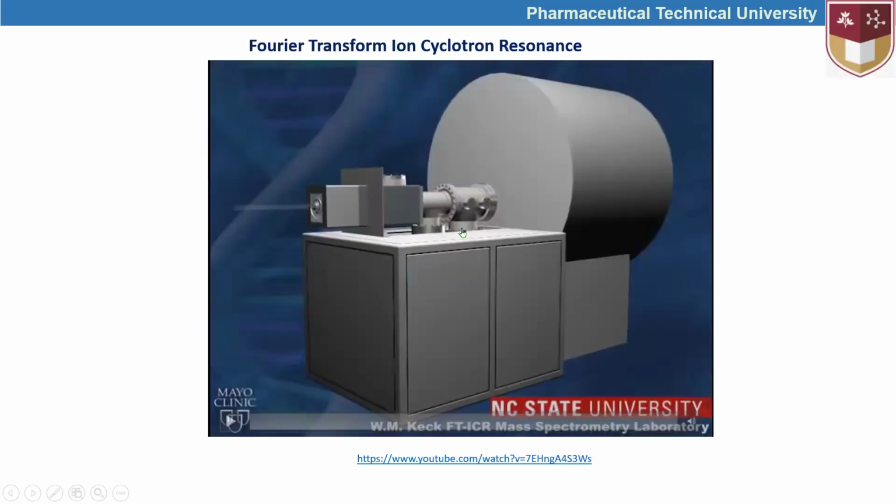And this one is the rare one, Fourier transform ion cyclotron resonance. In the second video lesson, we said that this tool is very expensive, and highly resolved results can be obtained by using this tool. Okay, now we are going to see how it works.